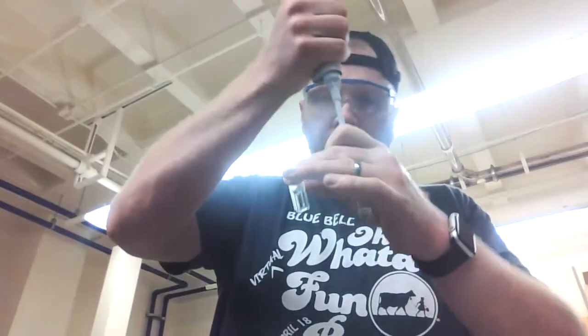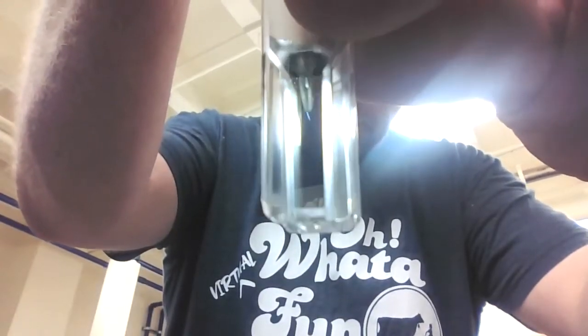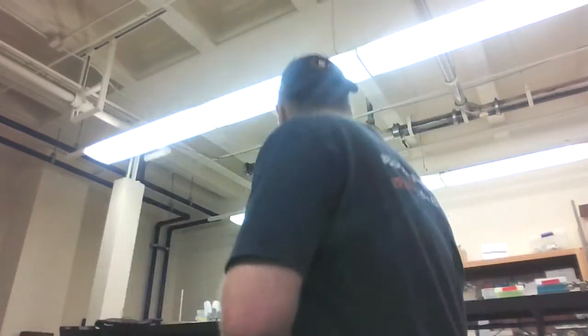I'm taking 100 microliters of my first fraction, which is the fraction that I really don't expect to have a lot of protein, if any protein in there at all. And I'm going to show y'all. Well, I do see a little bit of a hue change, so I do expect there to be some absorbance in the sample. That does indicate that there is some protein. Reading my first sample, spectrophotometer number 10, negative 0.060. Okay, so that is number 1, negative 0.060.